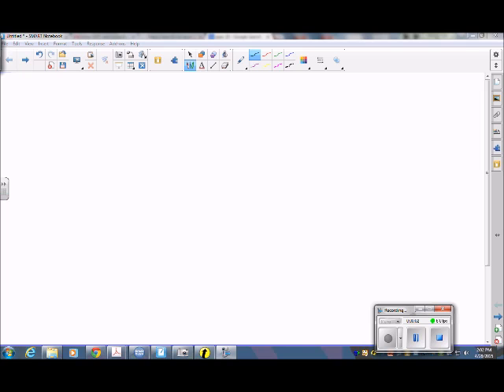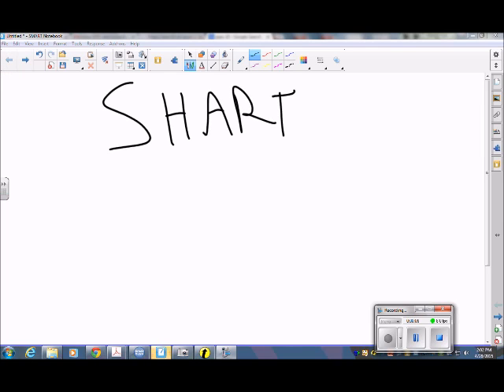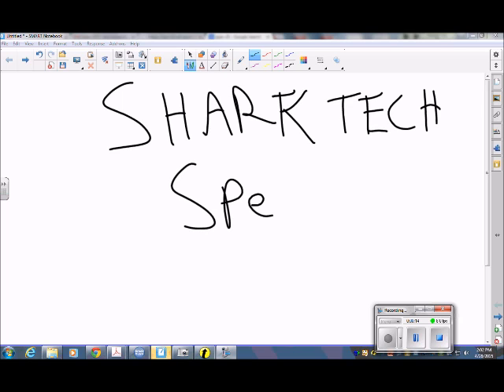Alright, so today we're going to be doing a video. What's this video going to be about? It's going to be about a spec. Okay, so welcome to Sharktech. Here goes our video. It's going to be about the spec, how to use it, how to calibrate it, and a bunch of random other things that I'm going to put in the video for no reason.